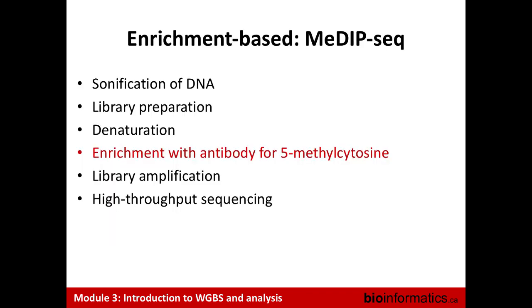Okay, so this is for microarray. Now we move on to some of the enrichment-based approaches. MeDIP-seq is one. This is similar to ChIP-seq from yesterday in many ways. You sonicate DNA, you do library preparation. This one is interesting because it doesn't have the bisulfite treatment. It uses an antibody that recognizes that particular modification, a bit like yesterday, where you can have an antibody to different proteins or different histone marks. So here you have an antibody that recognizes this particular mark, then you amplify, and then you do high throughput sequencing. Very similar to a ChIP-seq experiment.